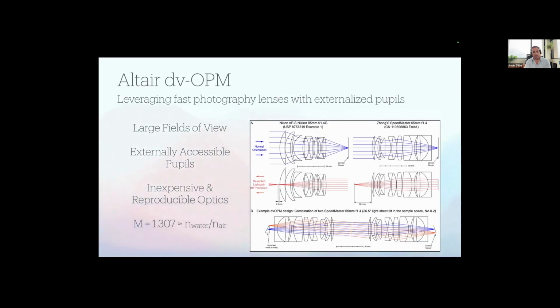And so lastly is the oblique plane microscope. Oblique plane microscopy is incredibly useful. I mean, there are a lot of kind of dirty secrets about light sheet microscopy, including that if you're going to use water dipping lenses, it's going to be hard to keep your cells sterile for long periods of time. And there are also lots of different things that can drift, especially once you've got a heated chamber.